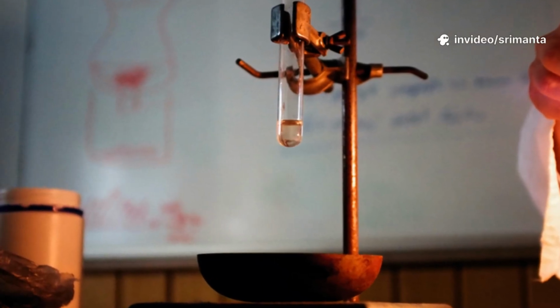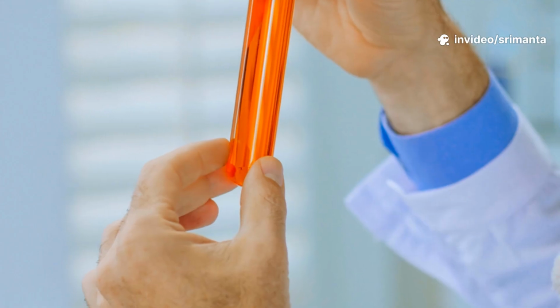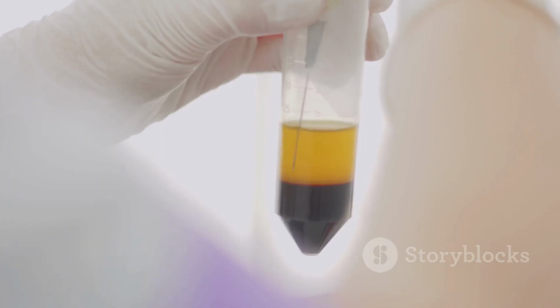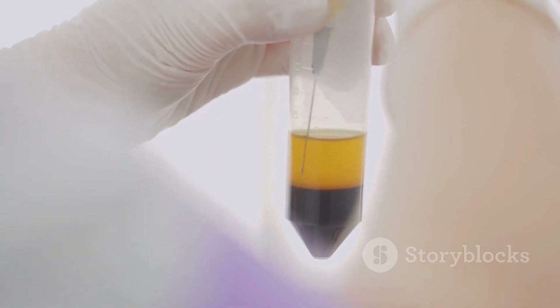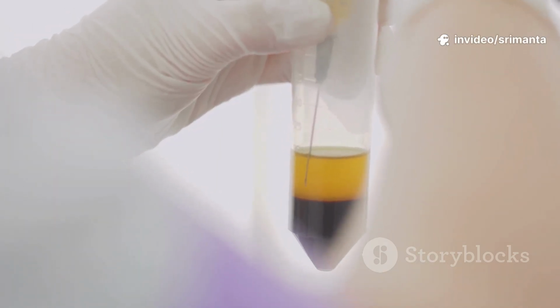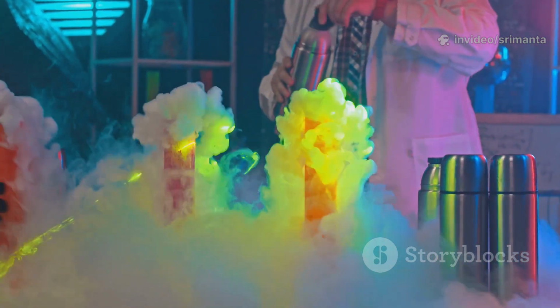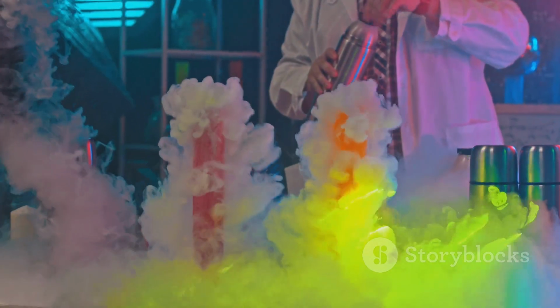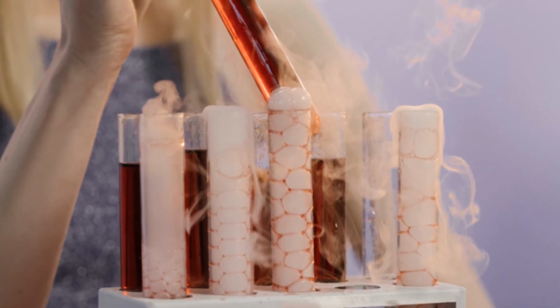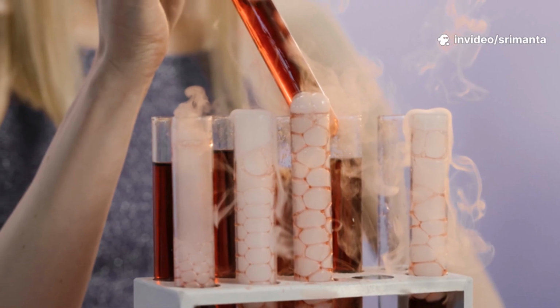We place a small piece of special paper, called mercuric chloride paper, over the opening. This paper is held in place by 2 clips or another special fitting. When the arsine gas flows out of the tube, it comes into direct contact with this paper. The mercuric chloride on the paper reacts with the arsine gas. This chemical reaction produces a distinct stain. The color of the stain is usually yellow, but it can turn brownish or orange depending on the amount of arsine gas. This stain is the final, visible proof that arsenic was present in our original sample.